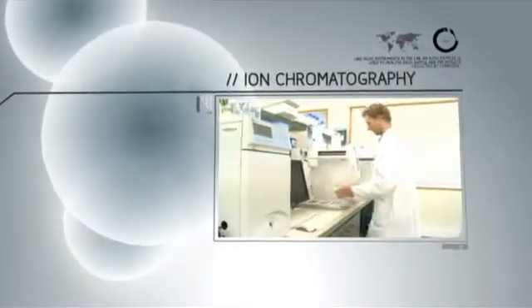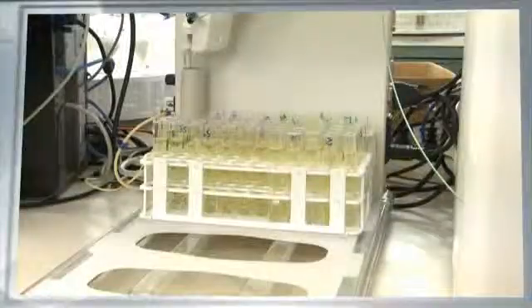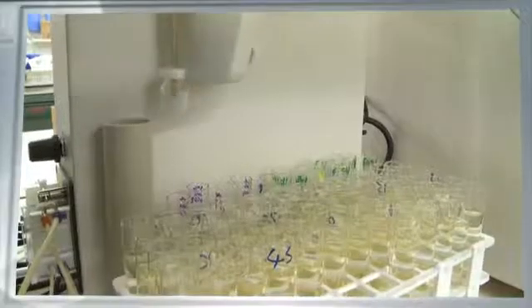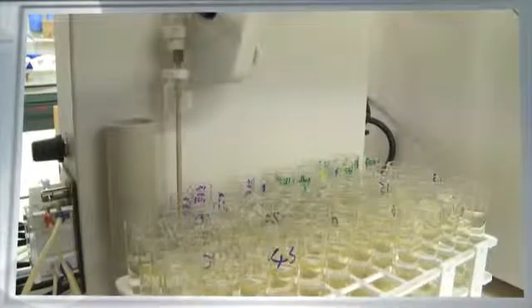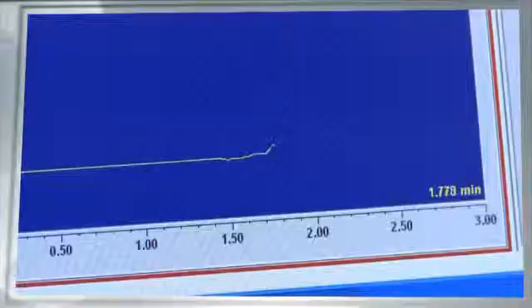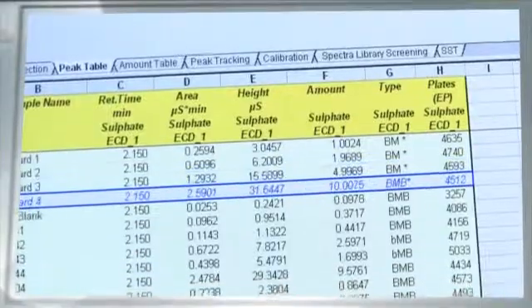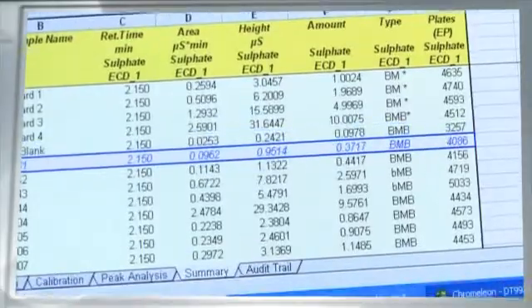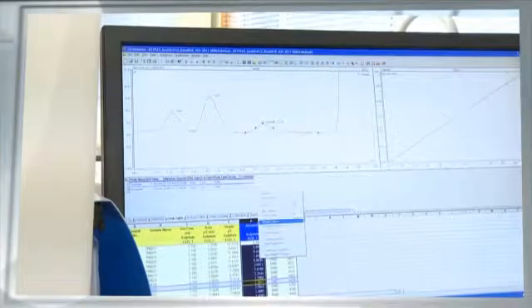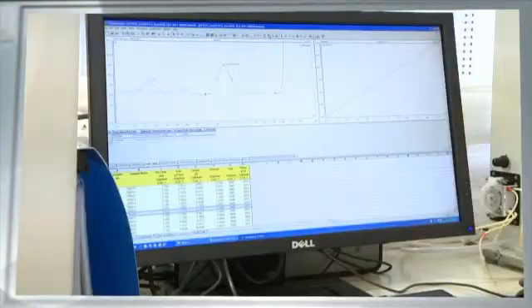The sulfate results of a soil sample are read by IC, or ion chromatography. Like most instruments in the lab, an auto-sampler is used to analyse each sample and the results collected by computer. Once the results are complete for the batch, an analyst checks them and submits them through to Sample Manager, where they're stored against the unique lab ID number issued at login.